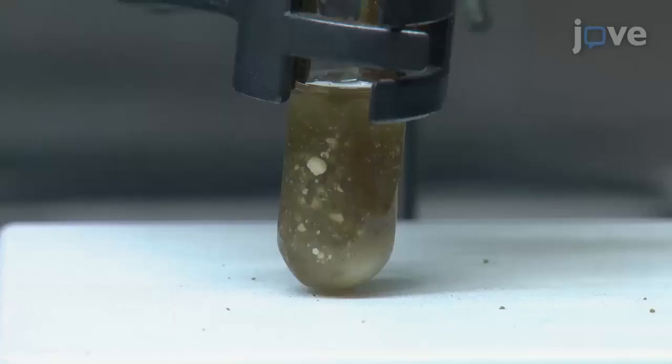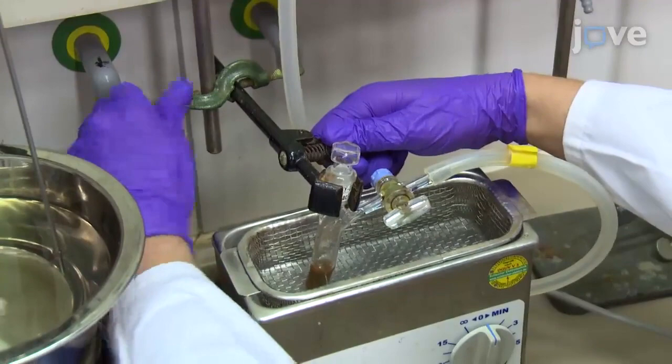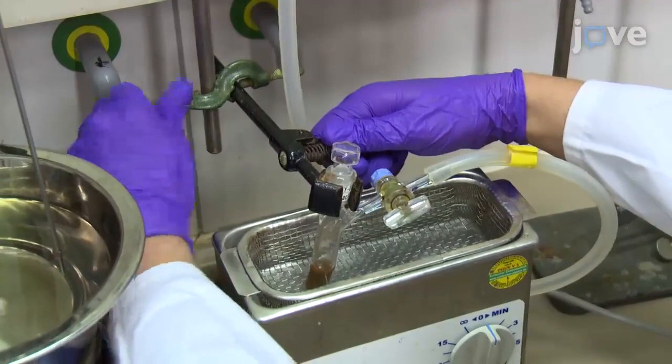Suspend the precursors in the ionic liquid. Stir the solution at room temperature overnight at the vacuum line to dissolve the precursors in the ionic liquid. Then place the resultant solution in an ultrasonic bath at room temperature for 1 to 2 hours.